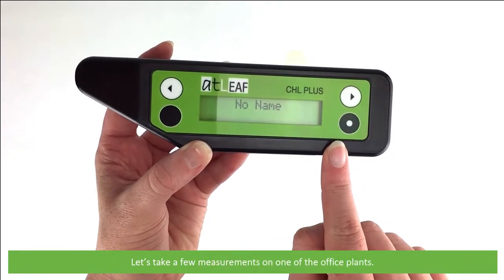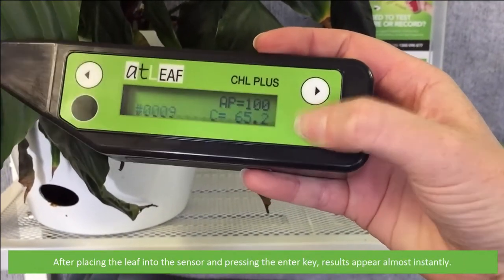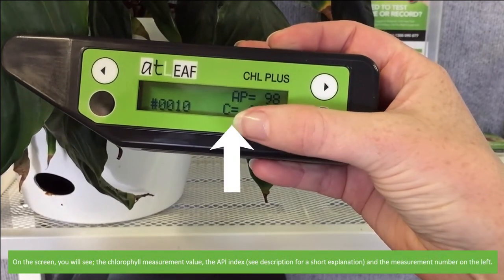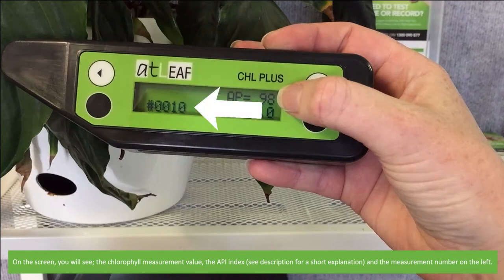Let's take a few measurements on one of the office plants. After placing the leaf onto the sensor and pressing the enter key, results appear almost instantly. On the screen you will see the chlorophyll measurement value, the API index — see the video description for a short explanation — and the measurement number on the left.